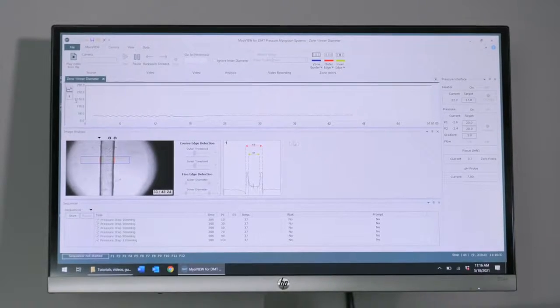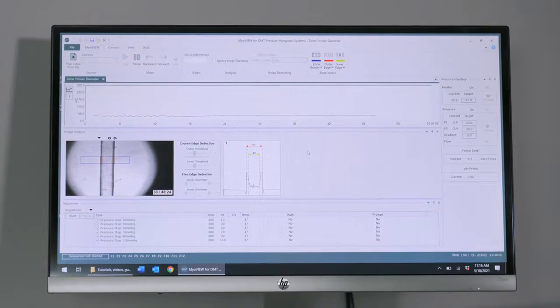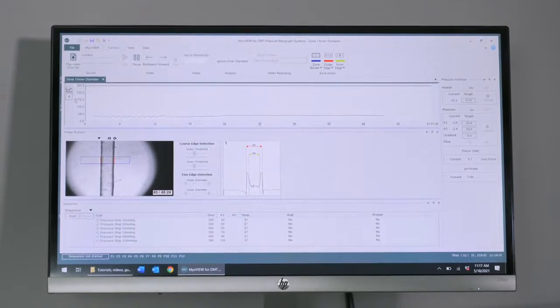The MyoView software is an automated wall tracking software. You can use it to control pressure, flow, and temperature in your chamber.